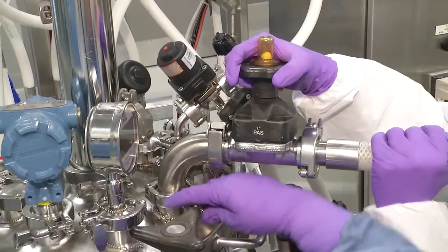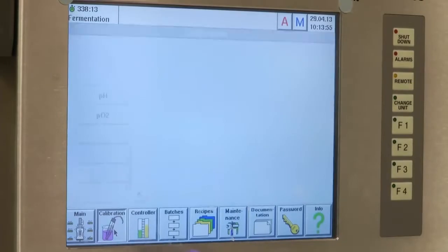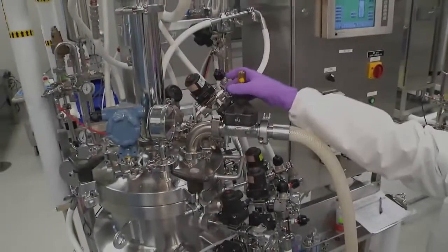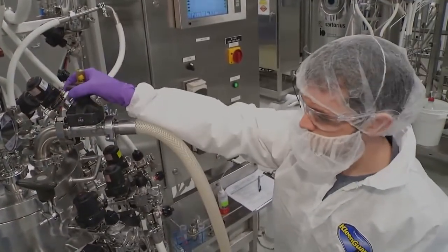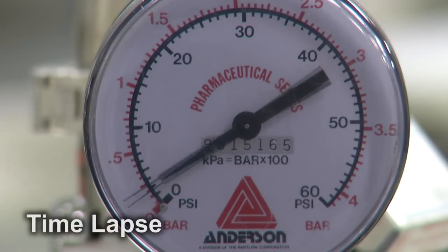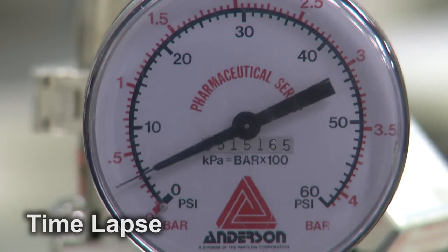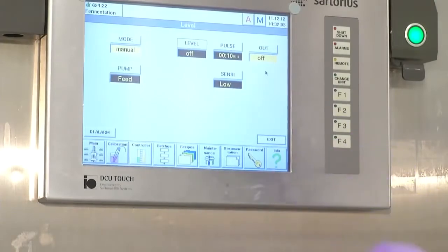Valves, caps, and lines are checked. Hoses are tightened. Probes are verified and calibrated. And 10 kilograms of HPW, high-purity water, is added to the vessel. The bioreactor is brought up to normal process pressure and held there in order to check for leaks. The pressure is monitored over a 30-minute period. If a leak is detected, the problem is corrected and the test is run again. Once the reactor passes the test, we are ready to mix the media in the vessel.